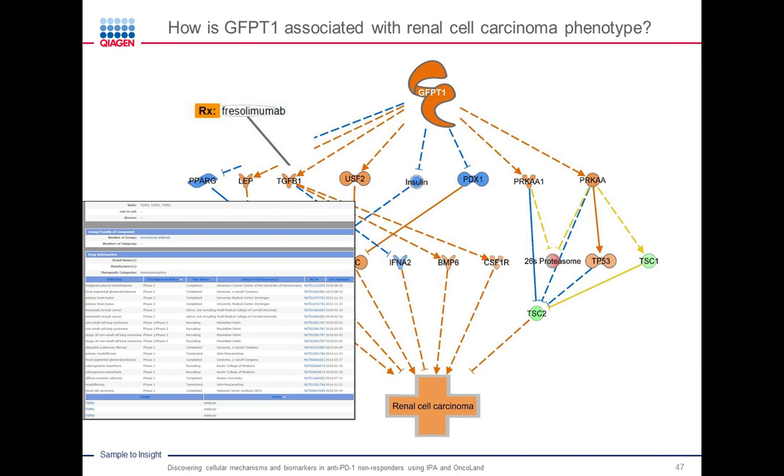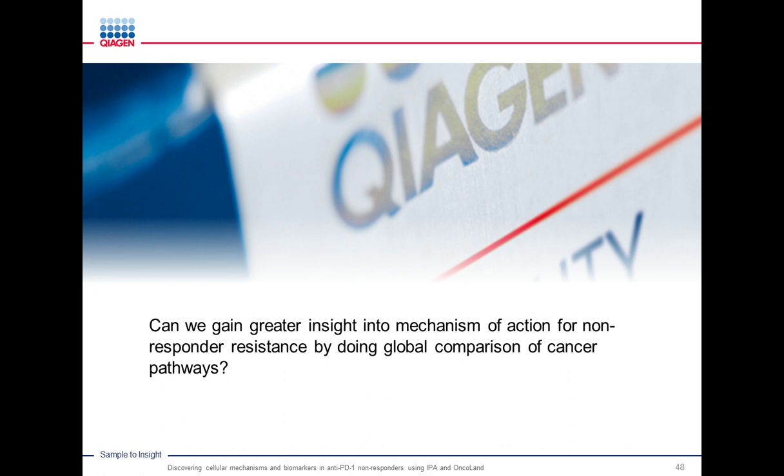What is it? It's an immunomodulator. What does it bind to? It binds to different members of TGF-beta1. So over here, I have just turned on one drug, but honestly, you can turn on drugs for many of the factors that you see on this network over here, right?